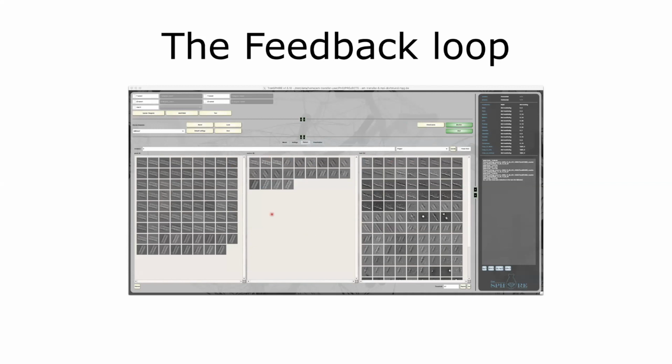Once the retrain tab is opened, it shows you the current result: Cinderella said those are good, those are bad. Either you agree with the result or you want to fine tune it so that it matches your data, because not every data set is like another one. In this case, I said these are actually good particles. Those are not really bad, but I don't want them in my training, and those are bad particles here. This is just an example.